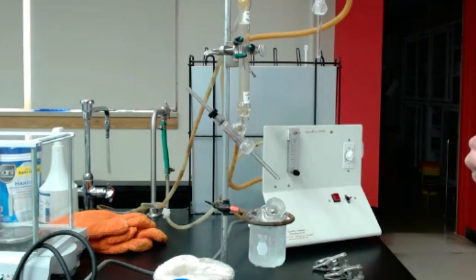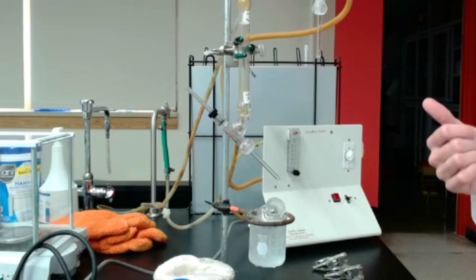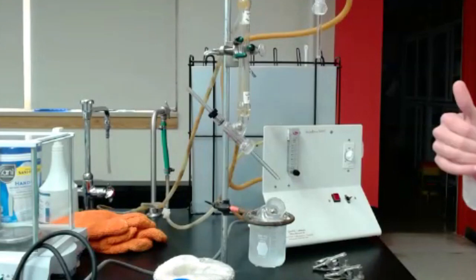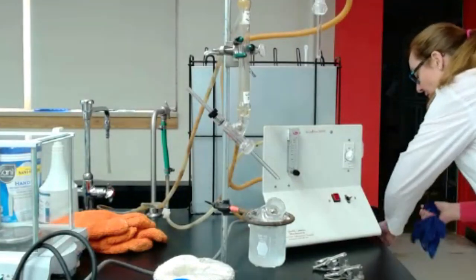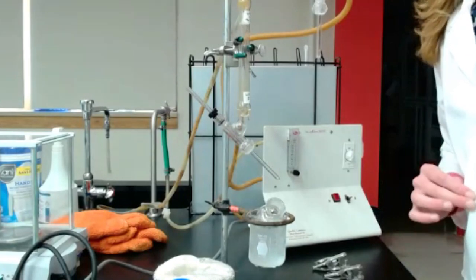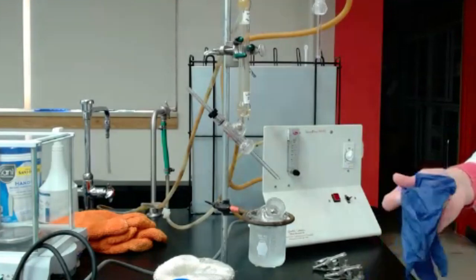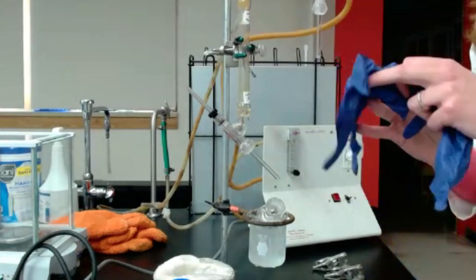It's using sodium hydroxide, which is a base, but that's also very corrosive. It's using hydrogen peroxide, which is an oxidizer. And so that's pretty bad as well. So make sure you have the protection, personal protective equipment. For us, you can probably see that I have the lab coat. That's because we are in a chemistry lab. So we wear everything. We also wear gloves.